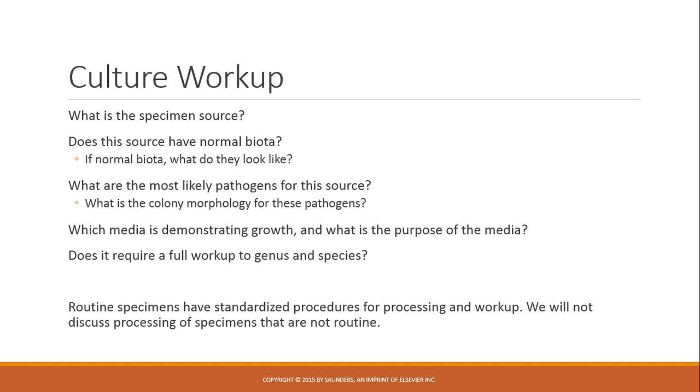Okay? So once we incubate it, 24 hours later, we come back, and we're ready to read our culture plates, or culture workup. When you first look at the sample, you want to take note, what is the specimen source? So in my mind, I'm going to think, well, what is normally present at that site, and what is a common pathogen for that site? So if I pick up a urine culture, I'm going to expect different pathogens than I would a respiratory culture.